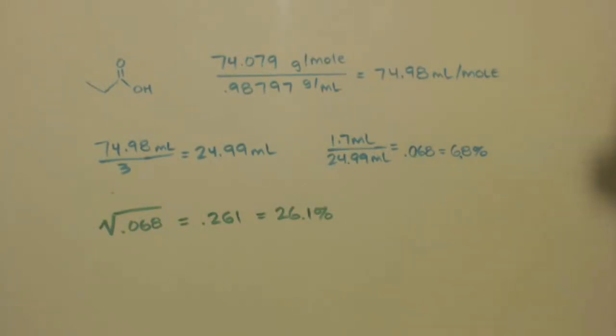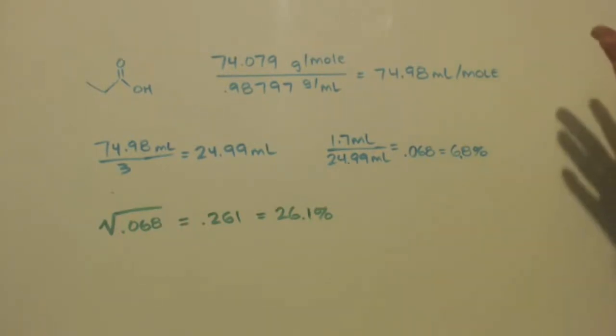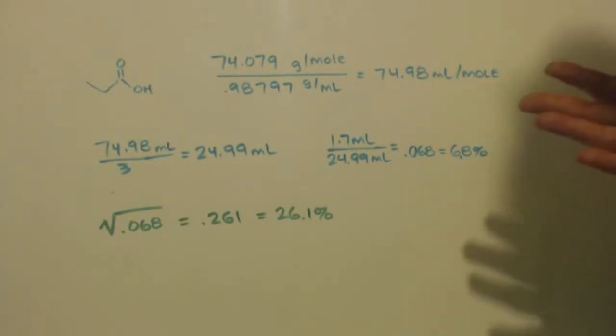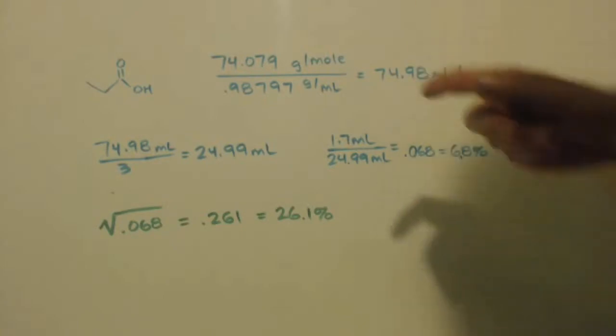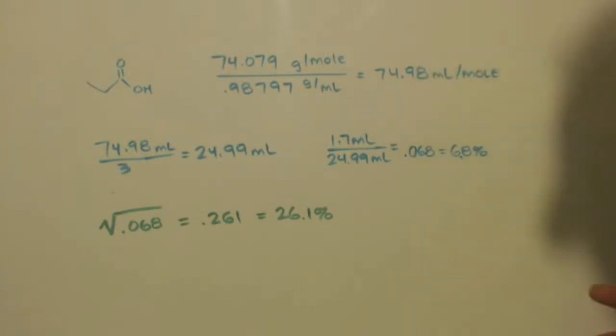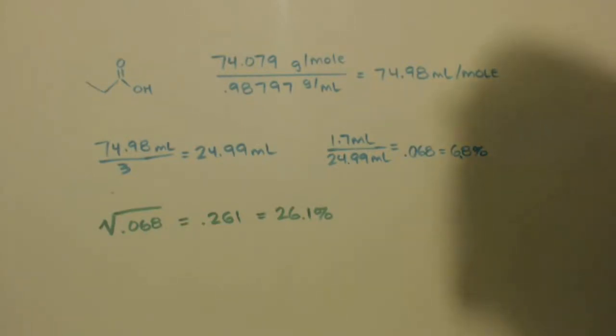Both terrible, okay? But considering this is my first time, I didn't control adding the ethyl bromide to the magnesium, and when I was making the ethyl magnesium bromide, in that same reaction, I didn't put any ether in the pot with the magnesium when I was dripping in the ethyl bromide. That was a big mistake. Also, as I just mentioned a couple minutes ago, I don't think I put as much baking soda in there.